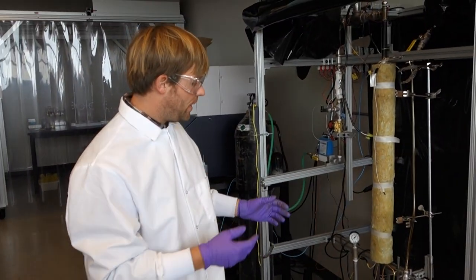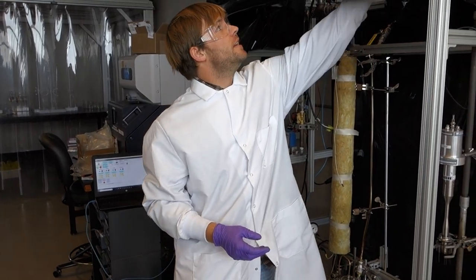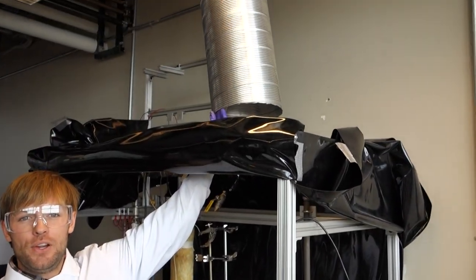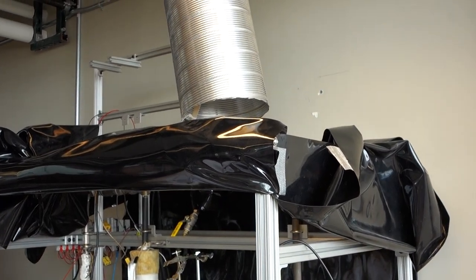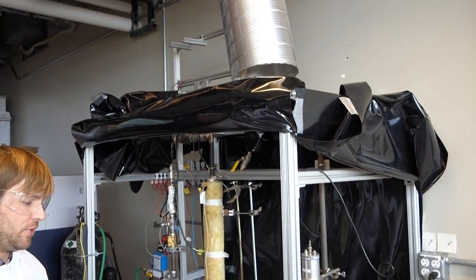The gas that's produced that isn't condensed is vented into a ventilation system here. This is a makeshift fume duct to prevent any fumes from contaminating other samples in the lab.